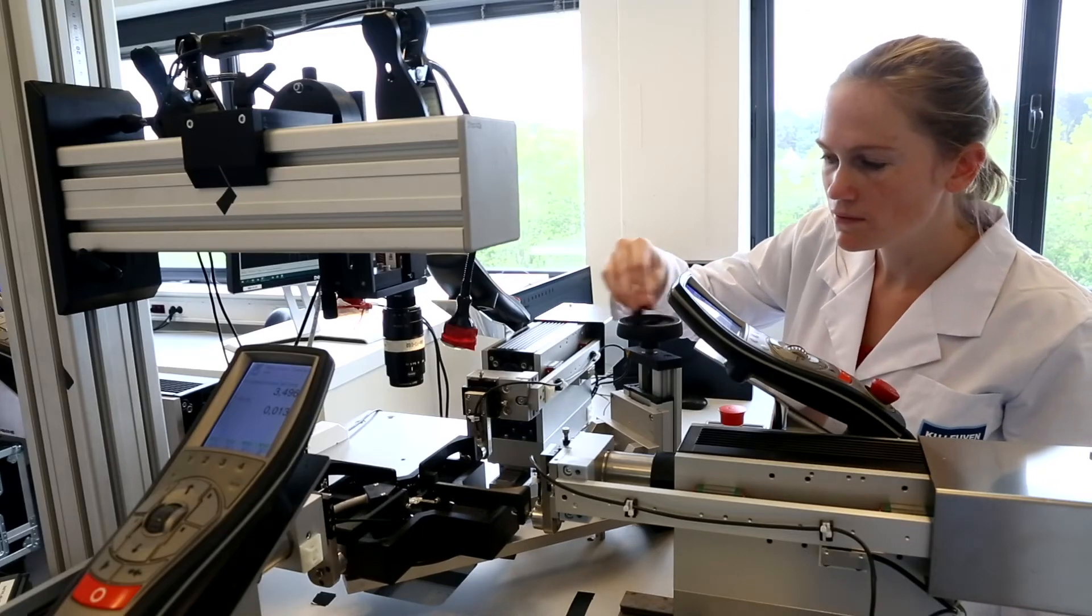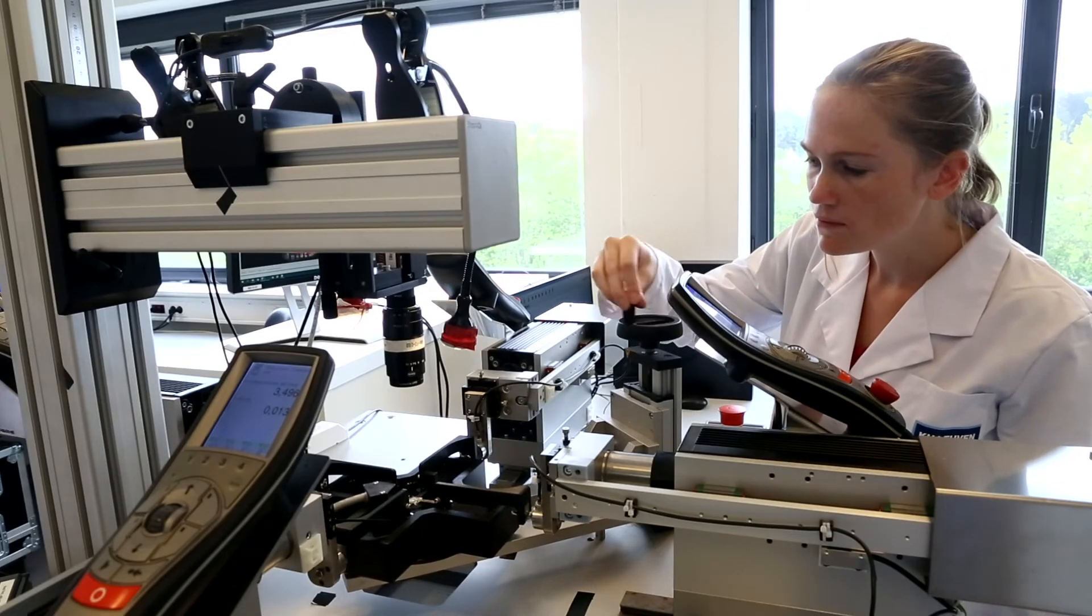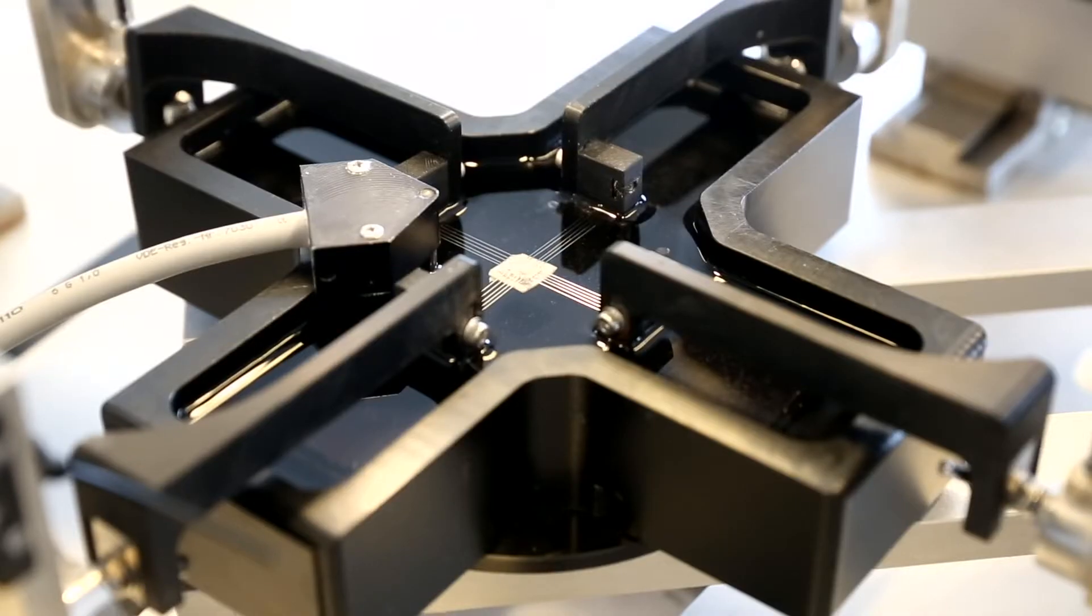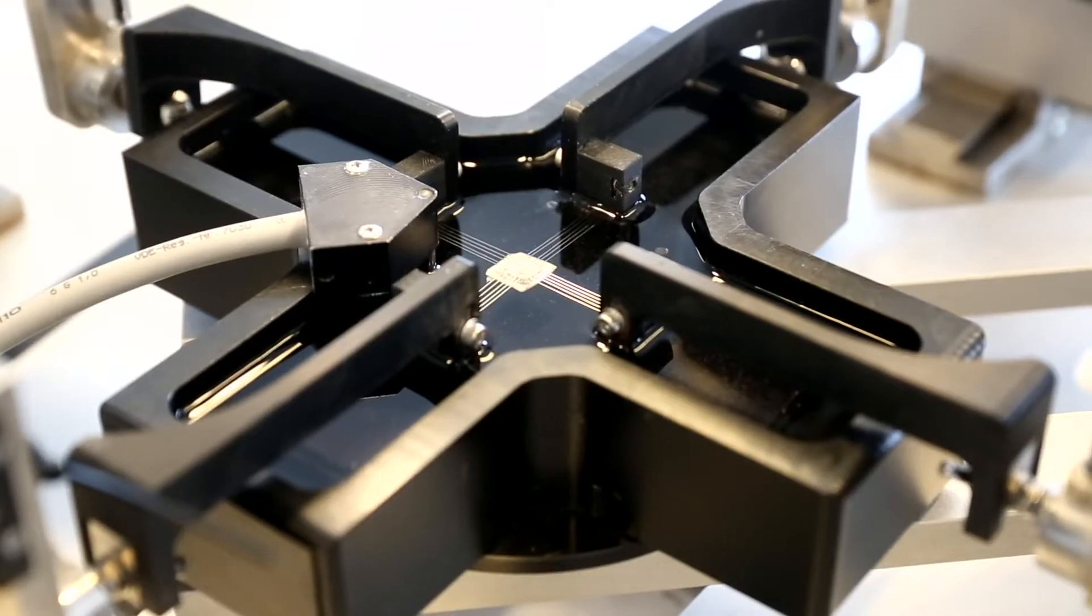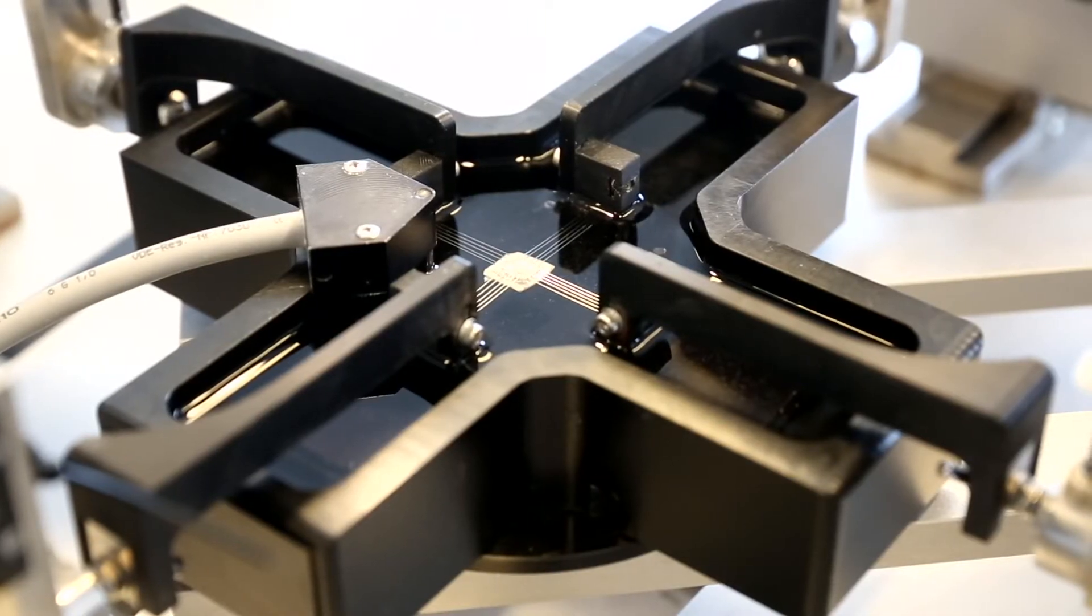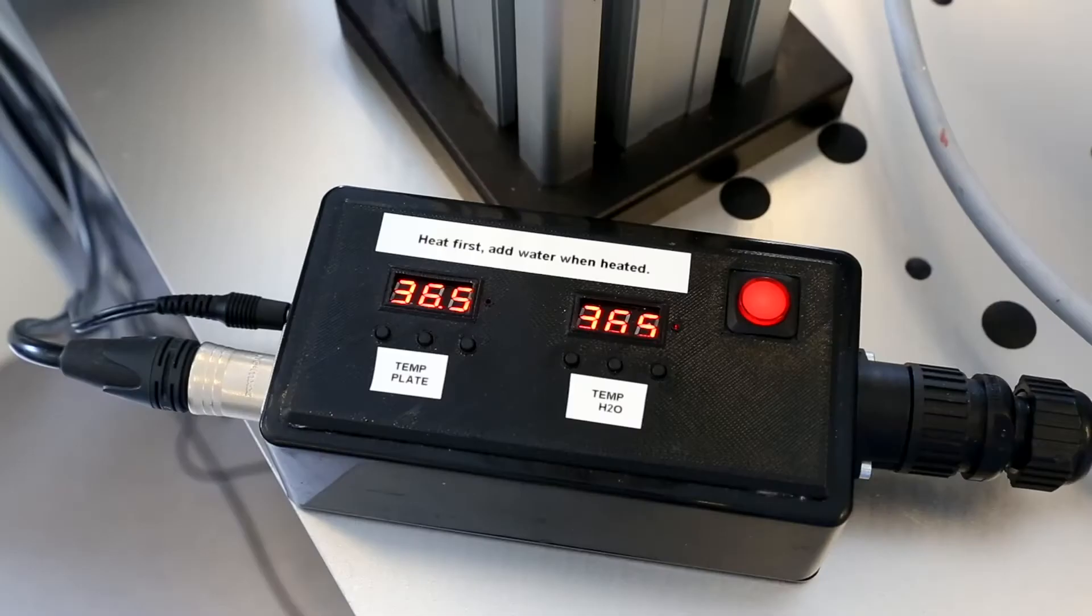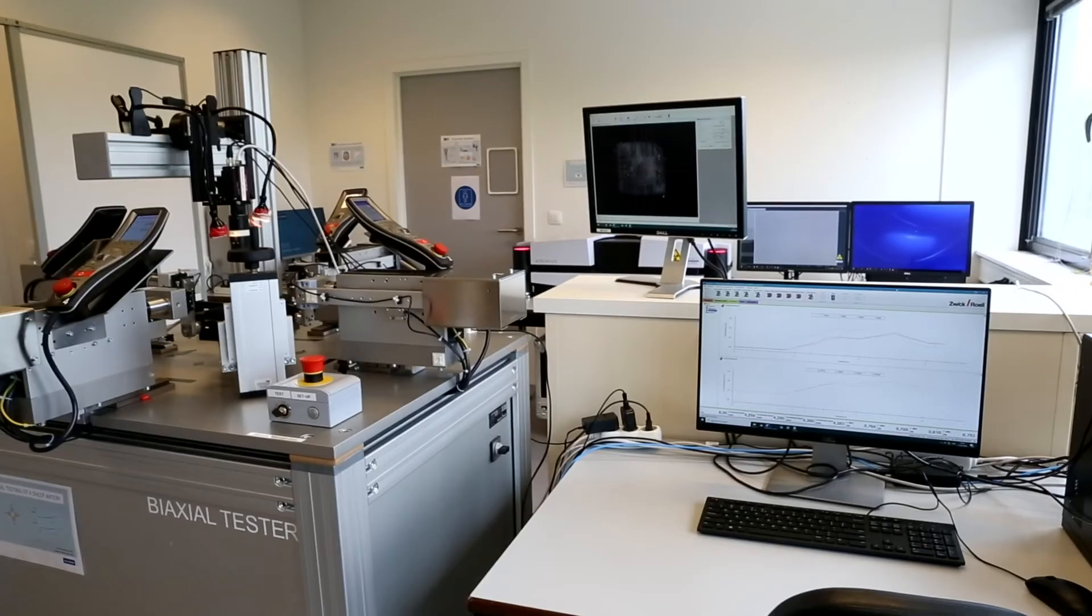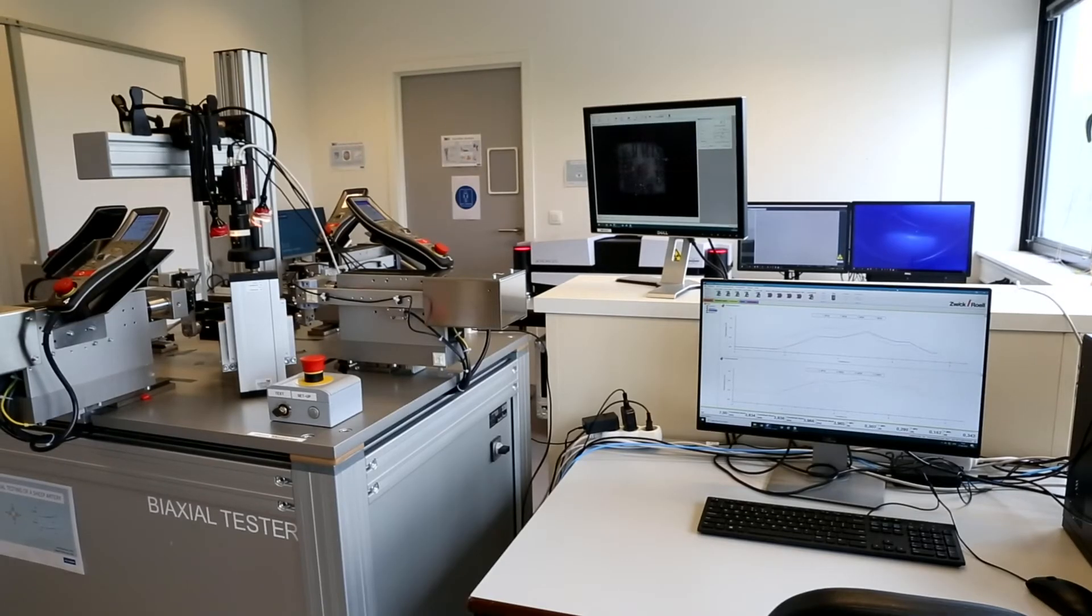The sample is then immersed in a temperature-controlled fluid bath that's filled with physiological solution at 37 degrees. This is to mimic the physiological conditions as closely as possible.